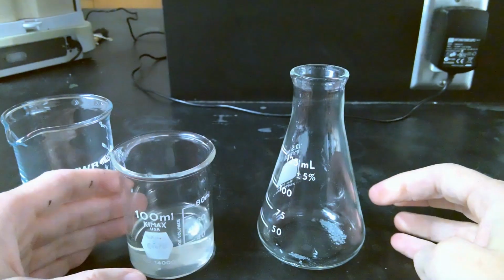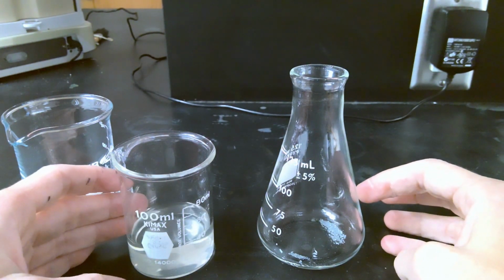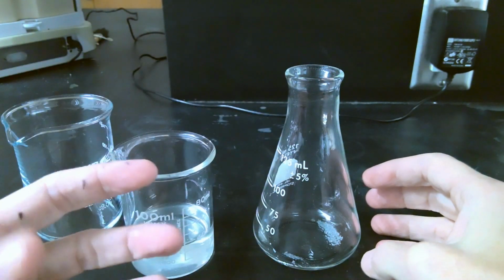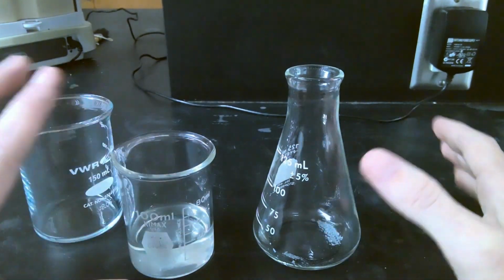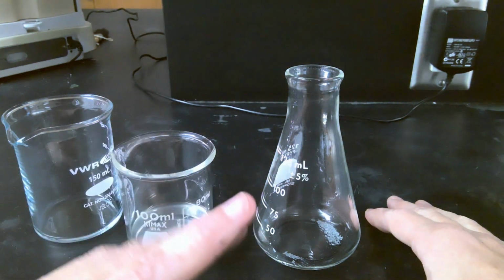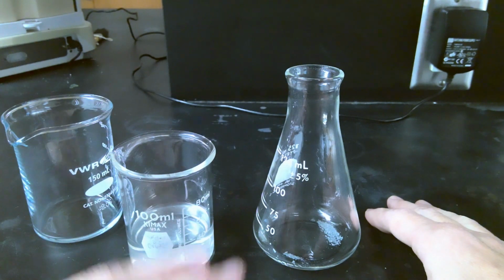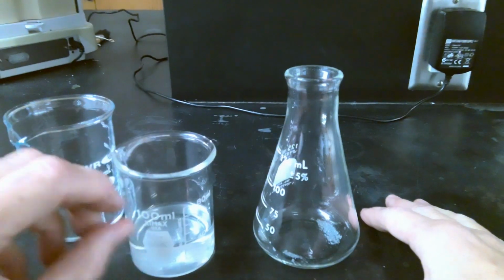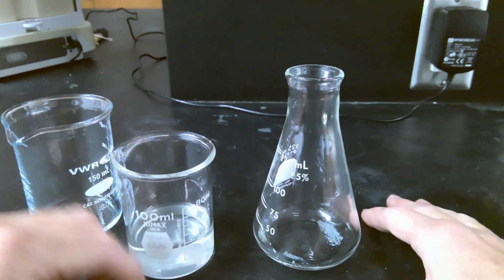So I'm carefully pouring the liquid out, making sure that none of the solid comes out of the beaker. There's going to be a little bit of methanol left. If I try to get all the methanol out, I'm going to wind up pouring out some zinc as well. And that's why we have to do the rinse steps, with the idea that there's always going to be a little bit of methanol left behind. That's fine. But we're going to do our best to transfer the zinc iodide to the other vessel.